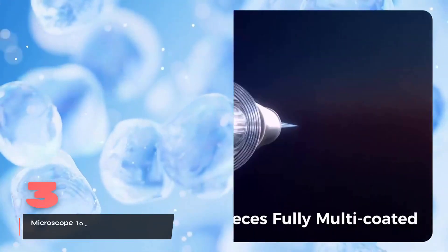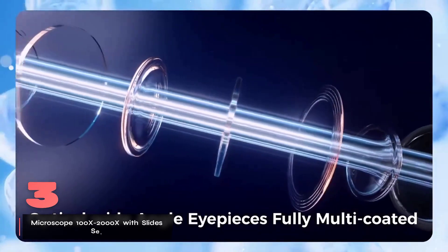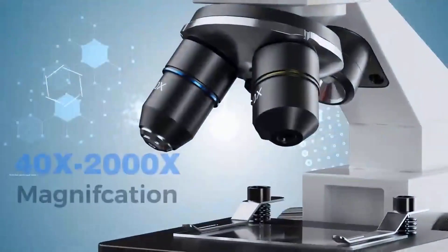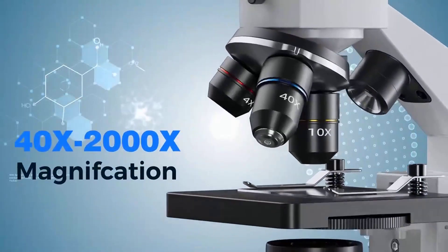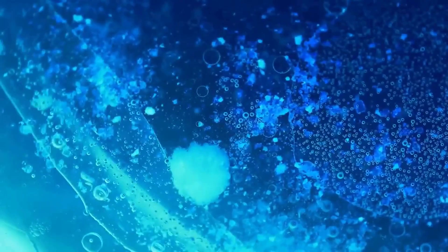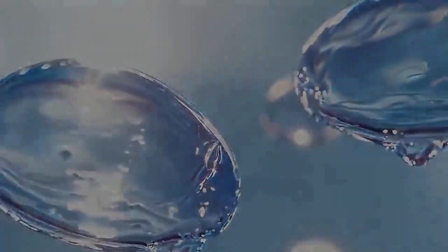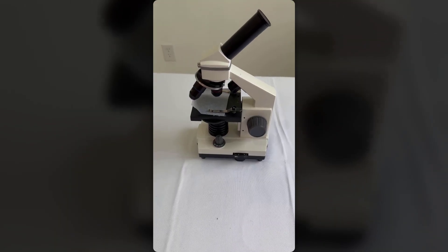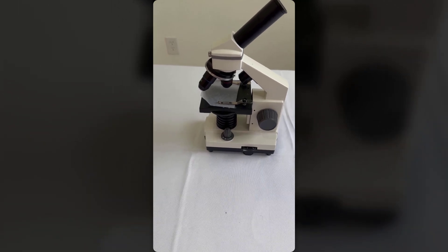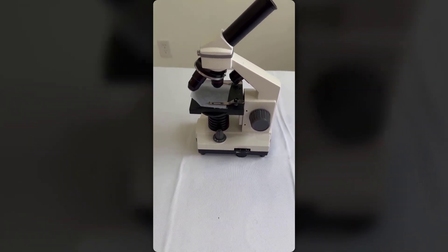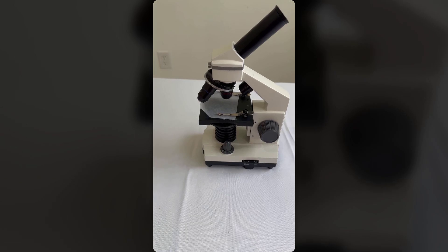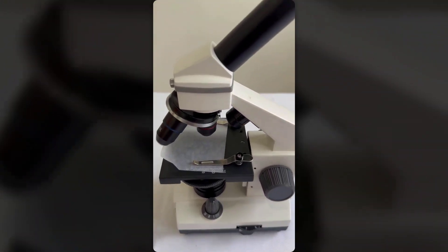Number three, the Zovtron Microscope delivers exceptional magnification power from 100X to 2000X, revealing intricate details of plant cells and microscopic life with remarkable clarity. Its six distinct magnification settings provide versatility comparable to leading models, effectively delivering multiple microscopes in one device. Built with a premium metal framework, the Zovtron matches the durability standards set by top competitors, offering superior stability compared to plastic alternatives.